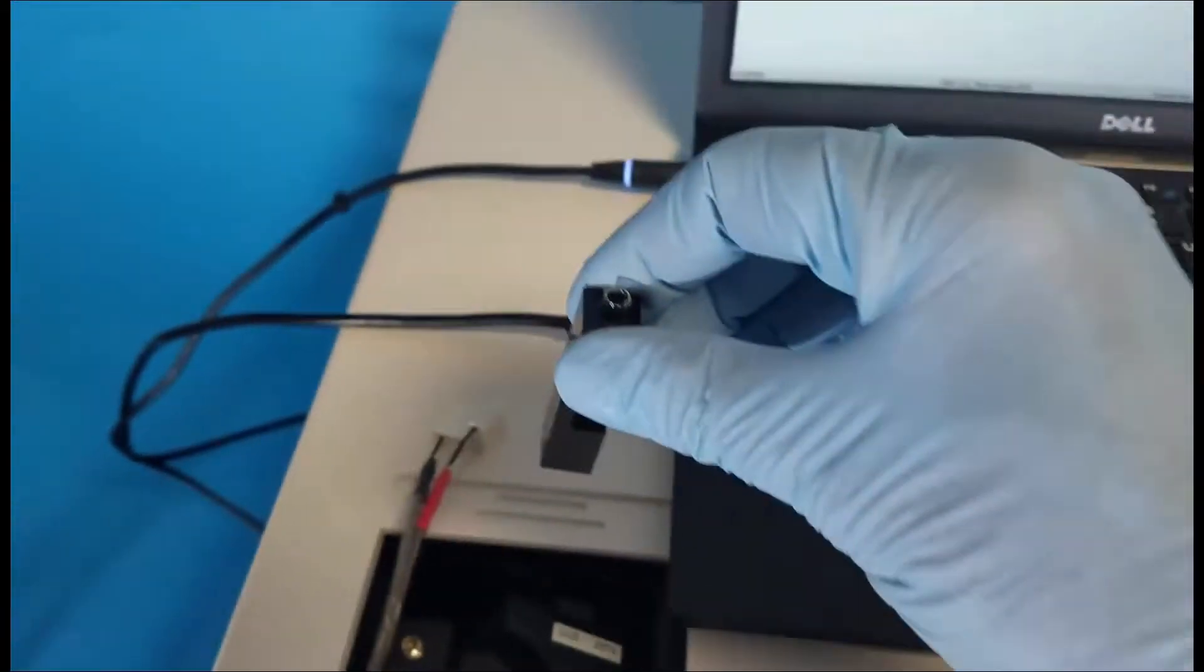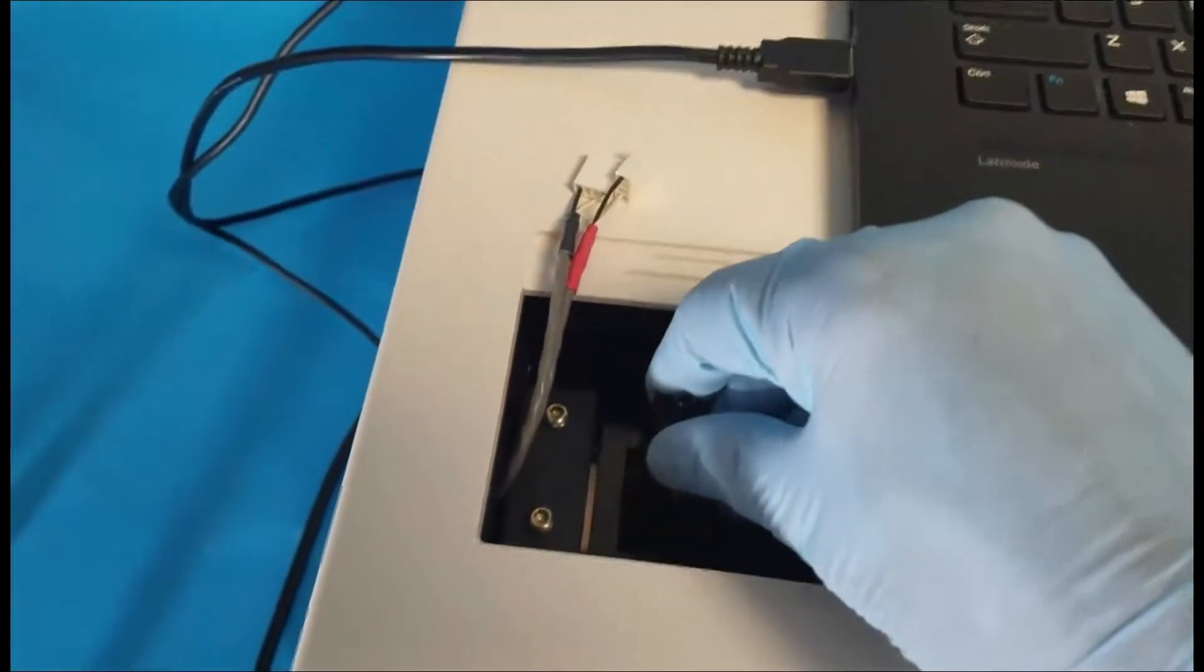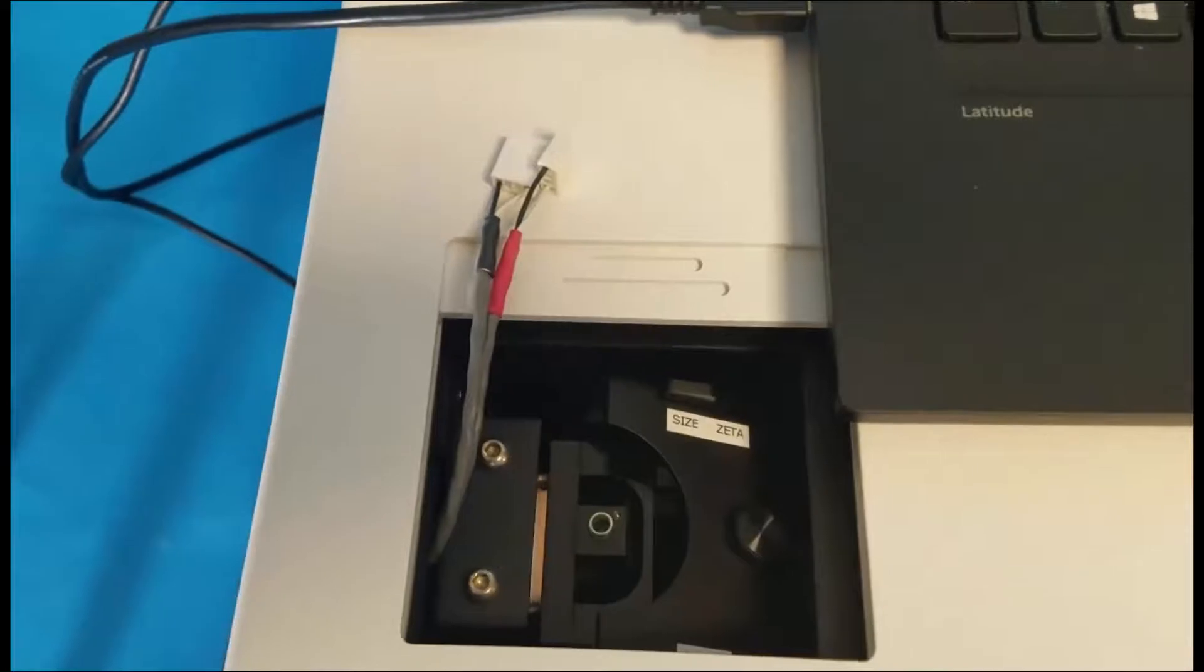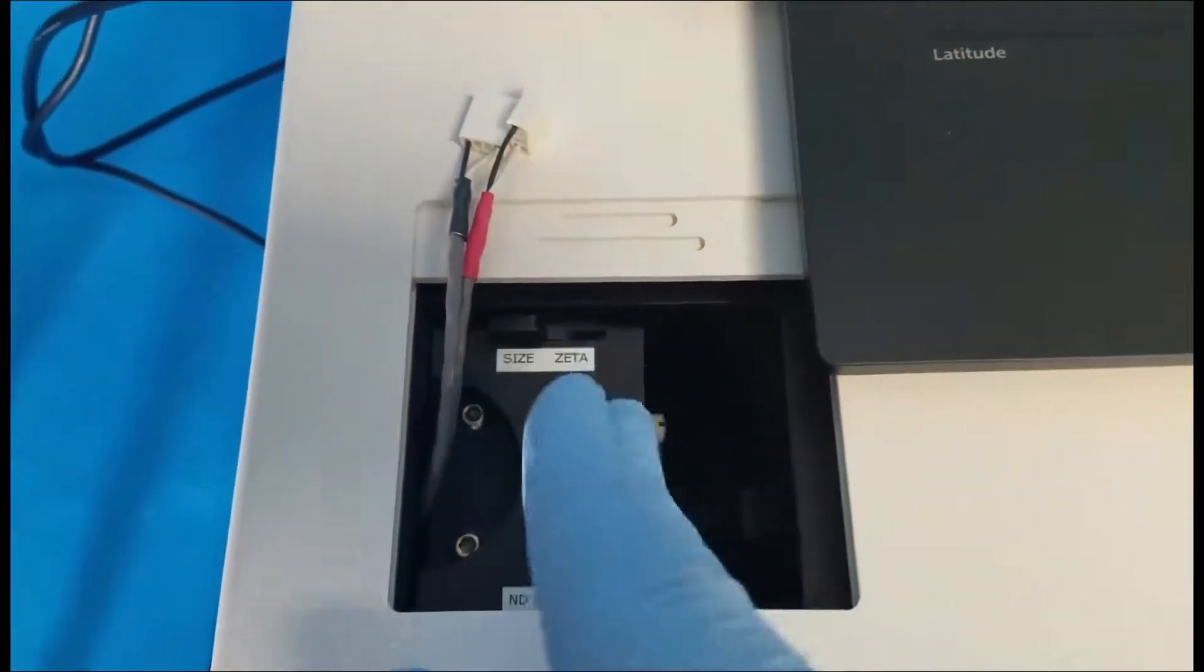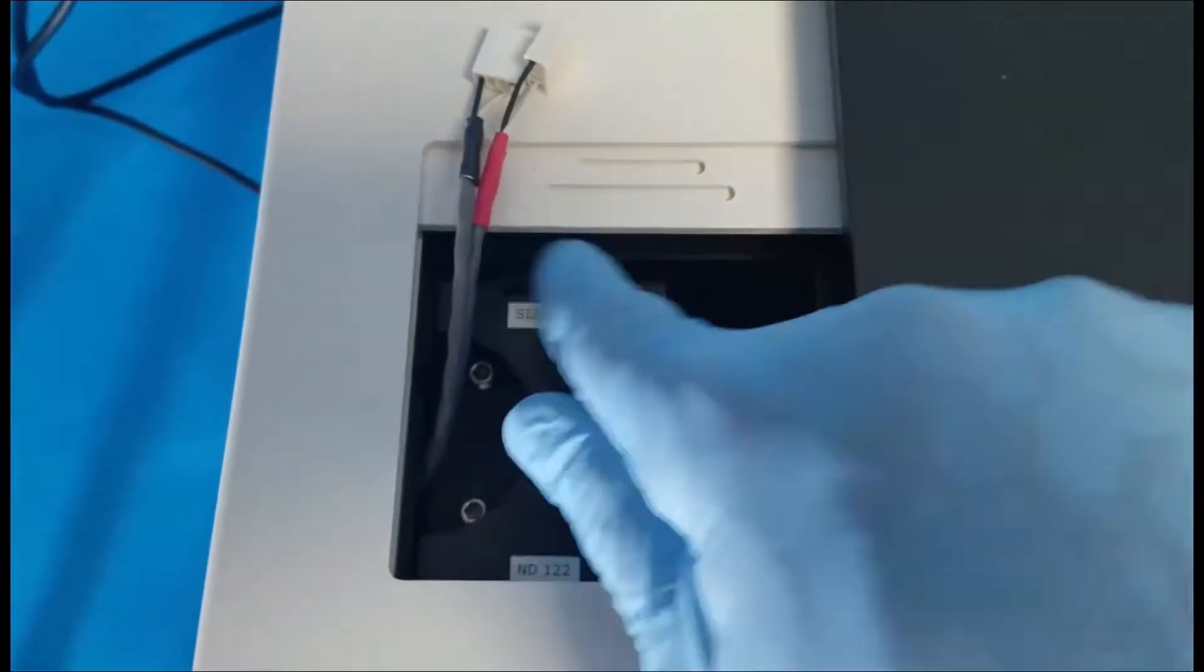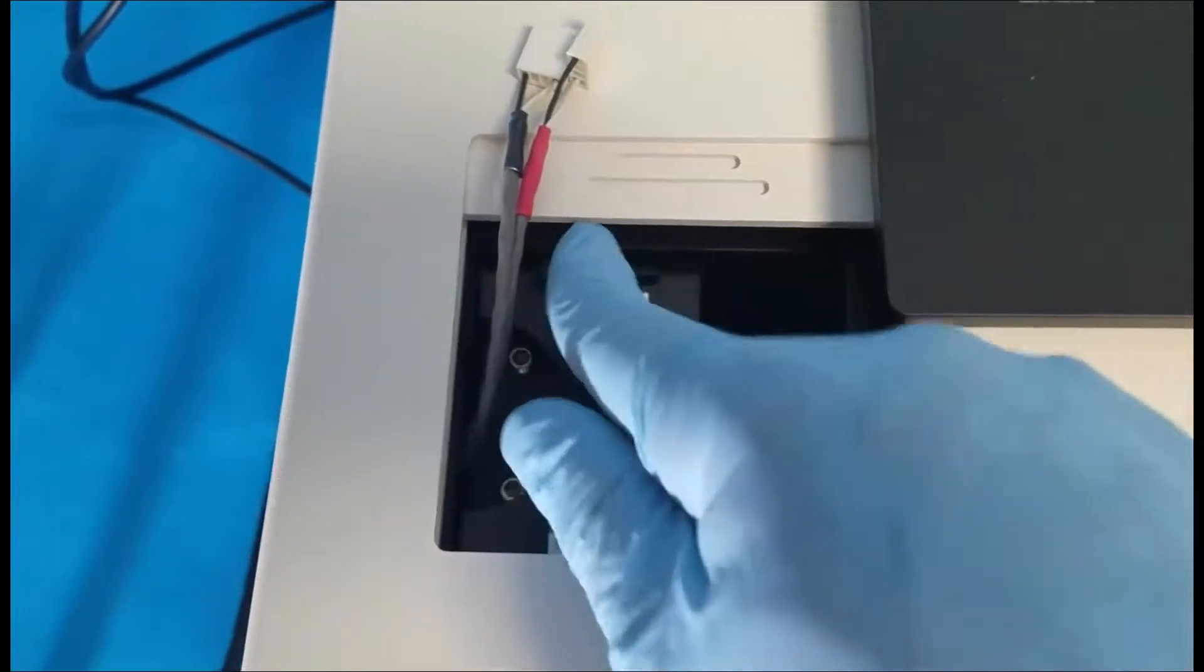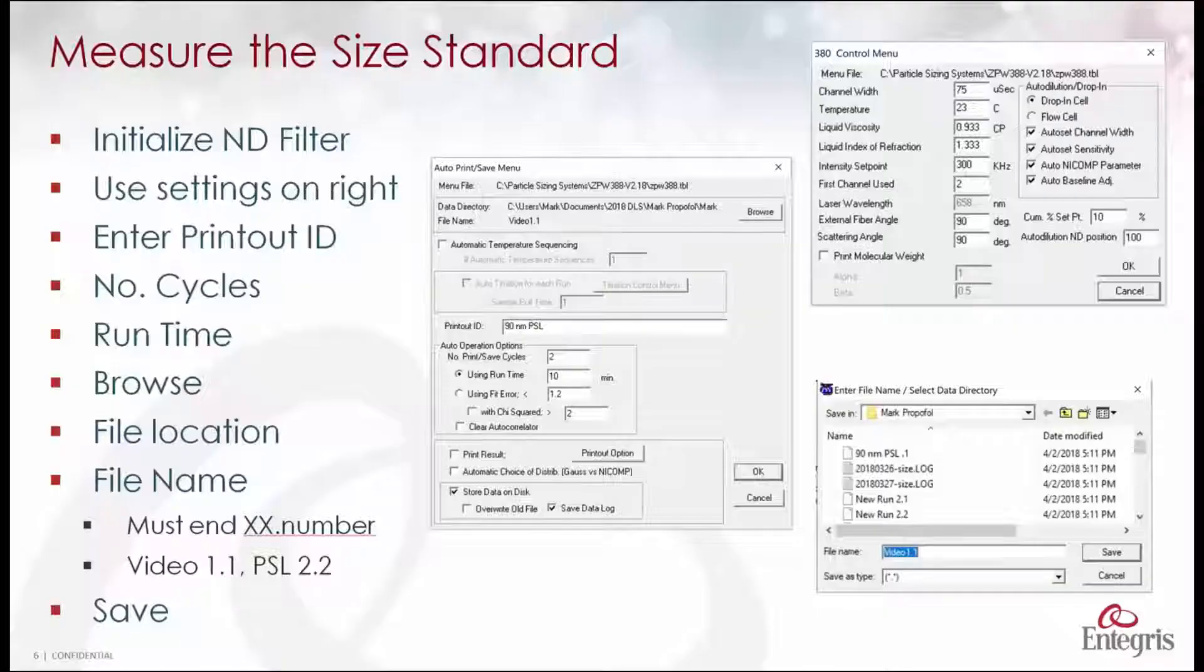Load the cell oriented as just described. There's a black plate in here. You move it over to the left and make sure that this is in the position for size not zeta if it's a zeta system and then close the door.